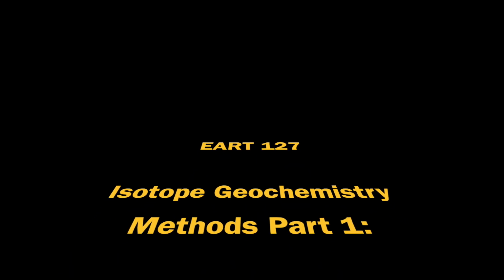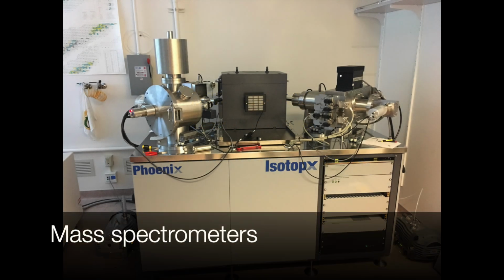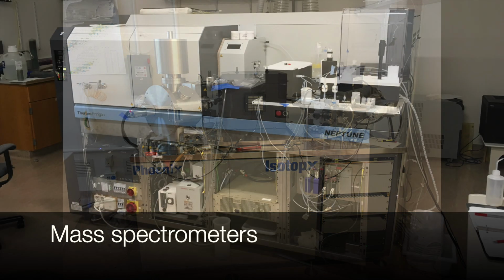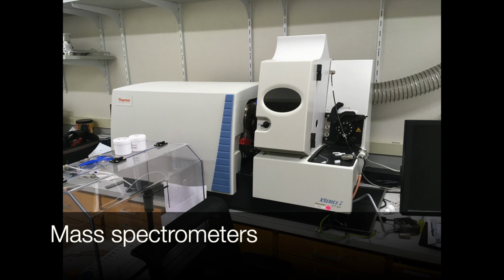Hi folks, this video and the next are going to cover the methods involved in going from a geologic sample, such as a rock, to an isotopic measurement of that sample. Typically, mass spectrometers work best when measuring the isotopic composition of an elementally pure sample. For example, if we are hoping to measure strontium isotopes in a rock, we want to load just the strontium atoms from that rock into our mass spectrometer. If we want to measure uranium, we only load uranium atoms, and so on.